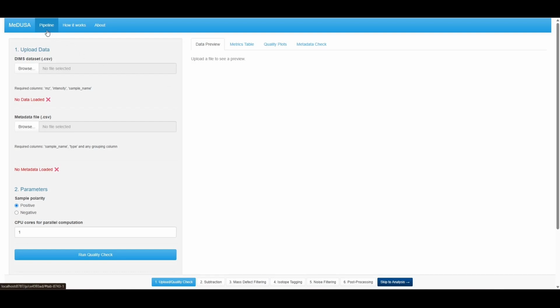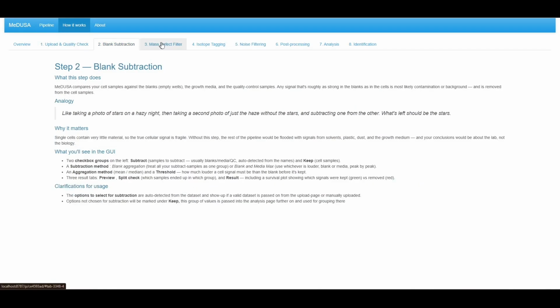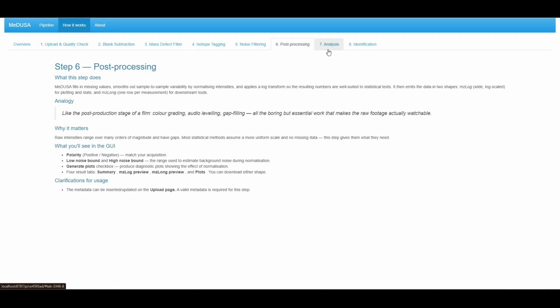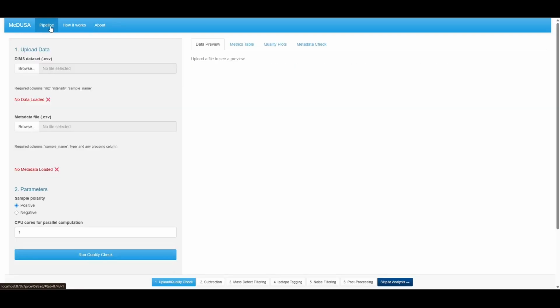At the top, there are three main pages. The pipeline, this is the place where all of the work is going to be done. The How It Works page, it contains the information about all of the steps of the pipeline. And the About page. This page contains the general information about MeDUSA.